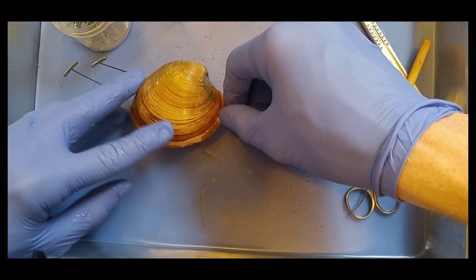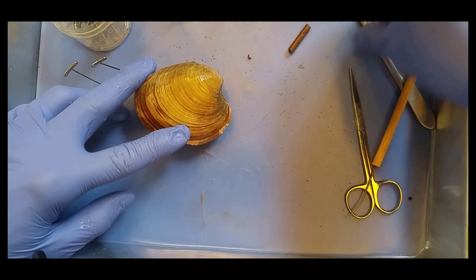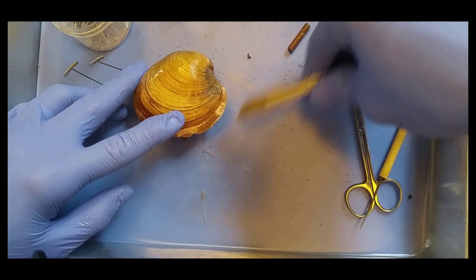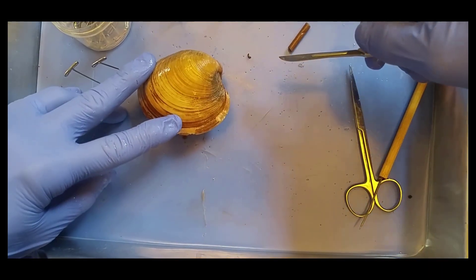Those muscles are called adductor muscles, and those muscles are found here and here. So to open the clam, we have to slice open those adductor muscles here and then here. But before we do that, let's learn about external morphology.